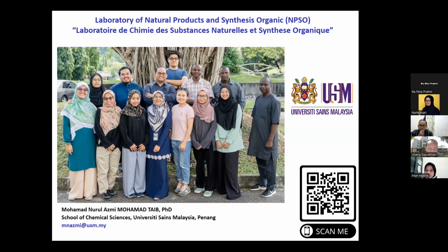But before you run your sample, ask the operators to run the standards first, doing line shape, for example, and calibration several times. And after that, inshallah, you will get nice spectra. It's the more technical part, so don't worry too much. That's why I prefer students to run the sample by themselves, because they know the quality and what they are hunting for.